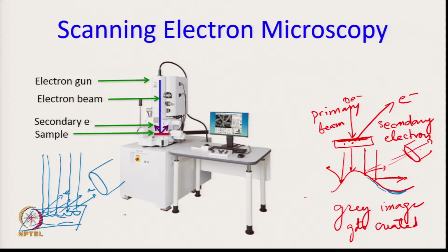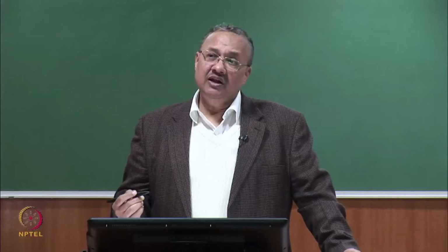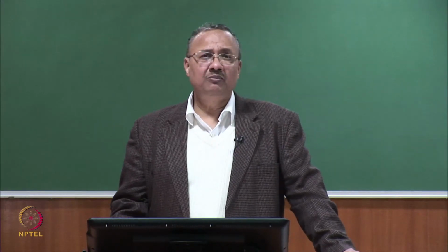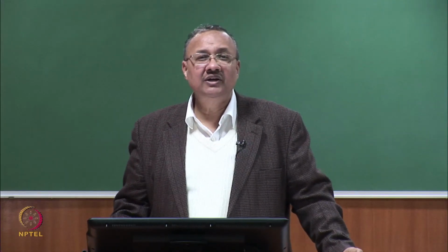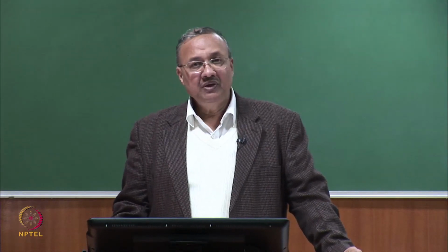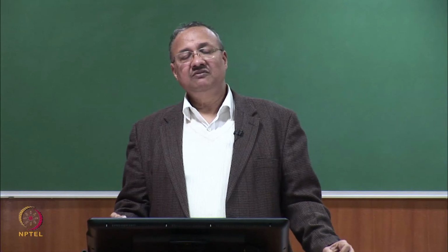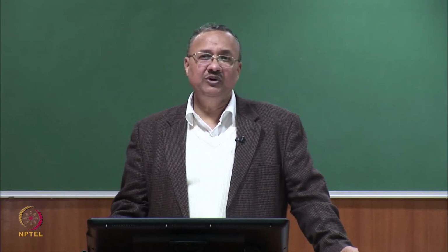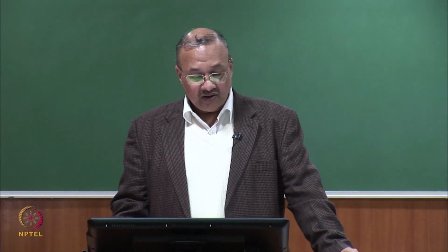So, we are interested in these secondary electrons. There are other detectors also in an electron microscope. I am not going to talk about them because this is not really a course in electron microscopy, that can take a very long time. I am only giving you the basic fundamental parts of it, so that it can help you to initiate in this direction.